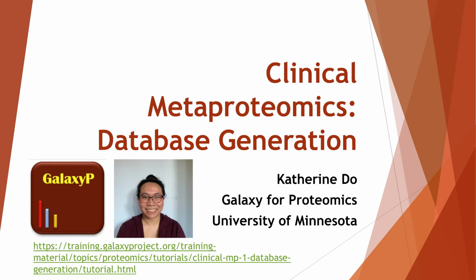The video preceding this video provided an overview of this tutorial where we covered the background of the metaproteomics field and why we developed this workflow. If you haven't already, please watch that video in order to gain better context for this video. Aside from the overview video, there is a total of 5 modules. In this video, we will cover the first module, Database Generation.